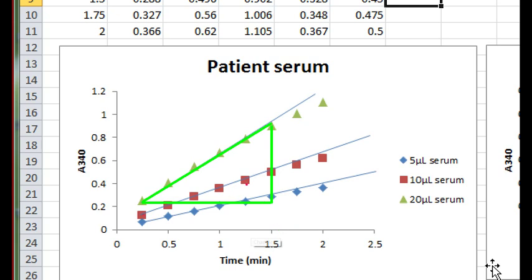For our red, a similar example exists. So here is our red. We have our run like this, and this is our gradient. And for the blue, again, it looks like it's linear from here to there. Okay, it starts to taper off around there, and it starts to taper off even more around there. And so therefore we can really only take this as our run, and therefore this is our rise. Okay, let's zoom out.